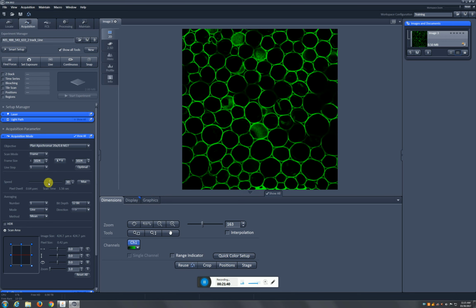The only downside is you're going to get a bit more of a noisy picture. What I mean by that is you're going to have some signal in your image which is not really true signal, and that poses a problem, because usually you want to have high specificity and high resolution in your image. So having the scan speed go higher is going to lose specificity in your image.